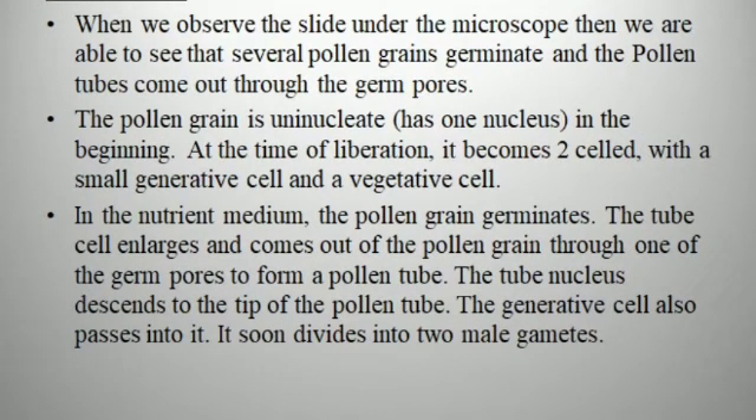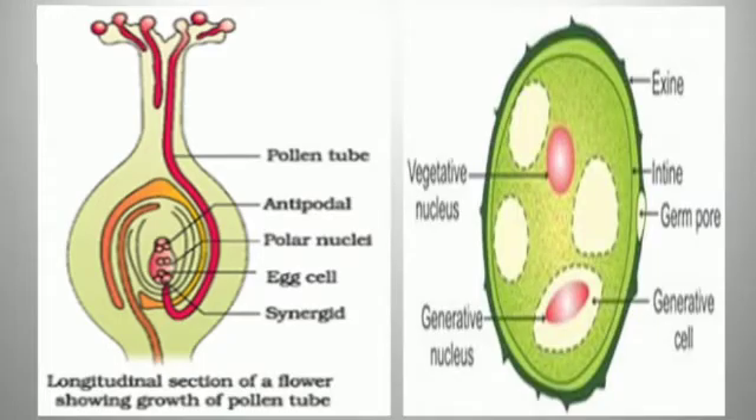When we observe the slide under the microscope, we can see that several pollen grains germinate and the pollen tubes come out through the germ pores. The pollen grain is uninucleate — it has one nucleus in the beginning. At the time of liberation, it becomes two-celled with a small generative cell and a vegetative cell. In the nutrient medium, the pollen grain germinates; the tube cell enlarges and comes out through one of the germ pores to form a pollen tube. The tube nucleus descends to the tip of the pollen tube. The generative cell passes into it and soon divides into two male gametes.